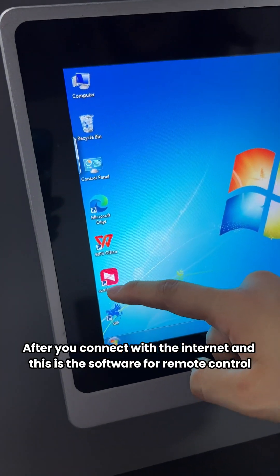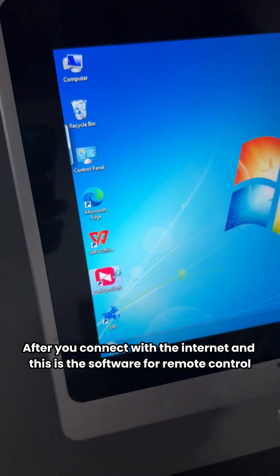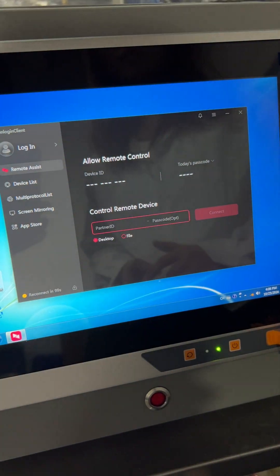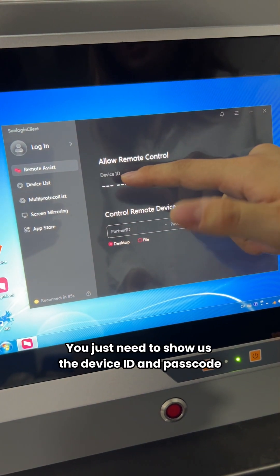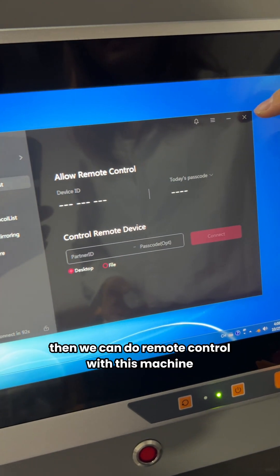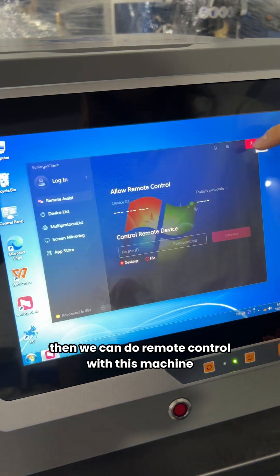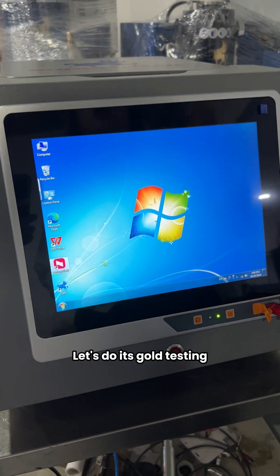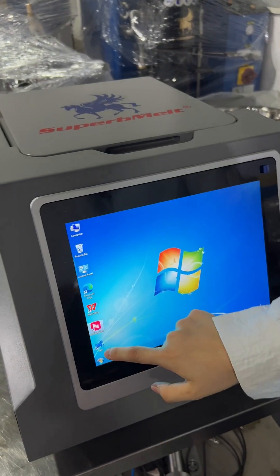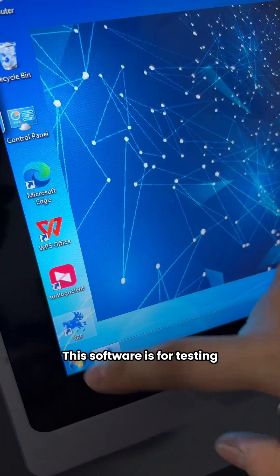After you connect to the internet, this is the software for remote control. You just need to show us the device ID and passcode, and then we can do remote control with this machine. This software is for full testing.